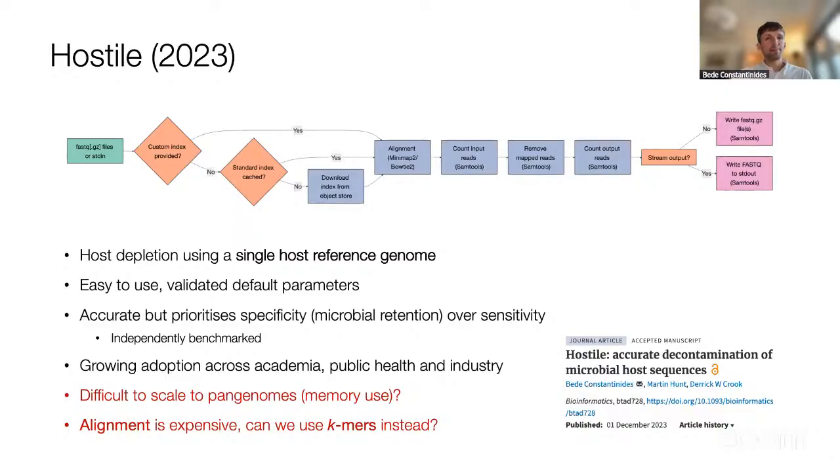And finally, being based on alignment, it is just relatively slow, particularly when dealing with host-heavy sequence data, where a lot of computation is essentially wasted aligning human sequences only for us to then throw them away. And I think it's important that something as basic as host depletion is as quick and convenient as reasonably possible.